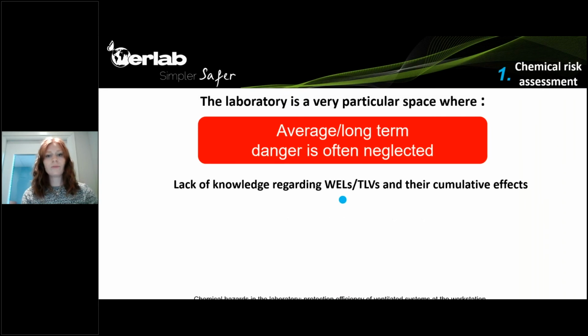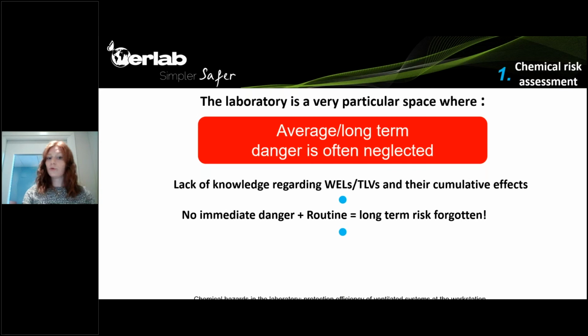As I'm saying, in the long term the danger inside the laboratory can often be neglected. Why? First of all, there can be a lack of knowledge regarding these WELs, and especially their cumulative effects, so the fact that we don't know the WEL for a mix of different products. Also, for some products there's no immediate danger, but the risk comes in the long term, and it is often forgotten.